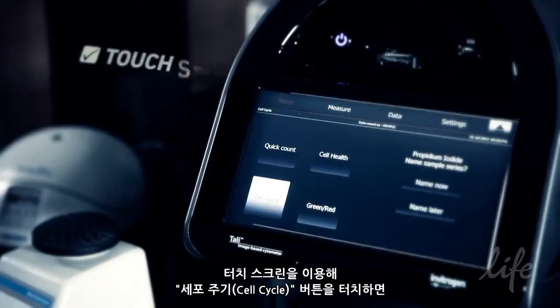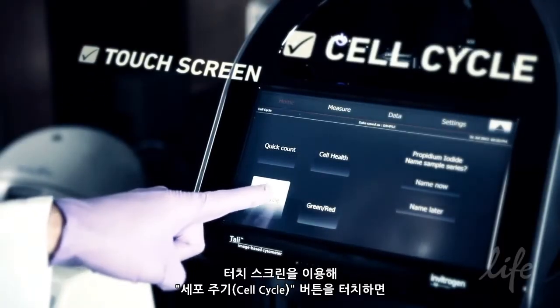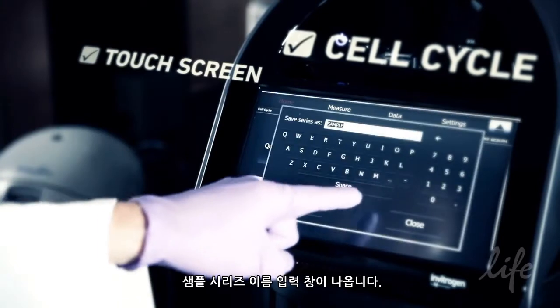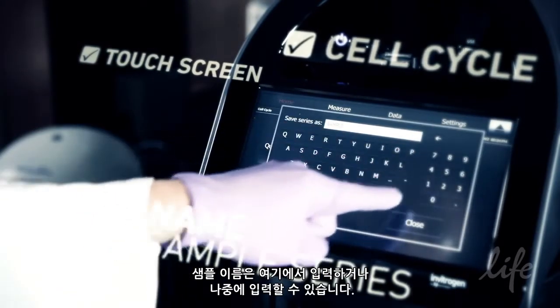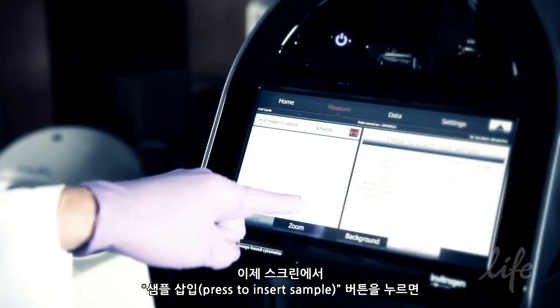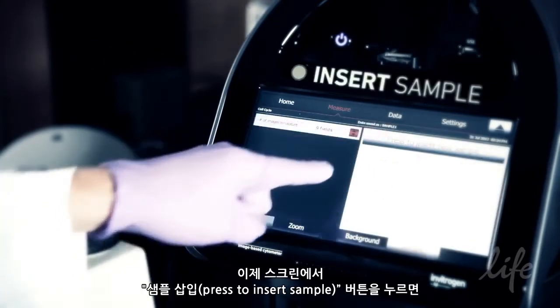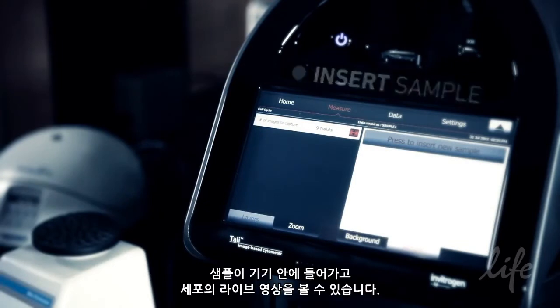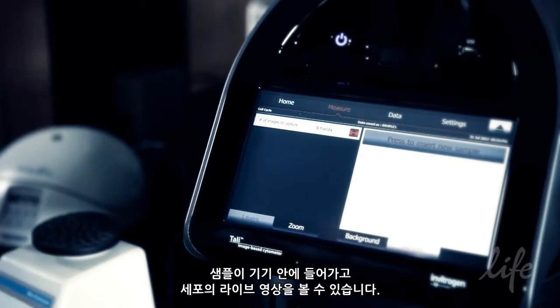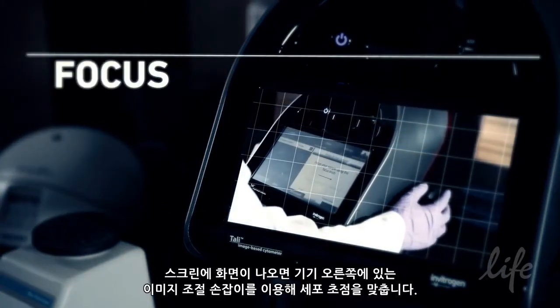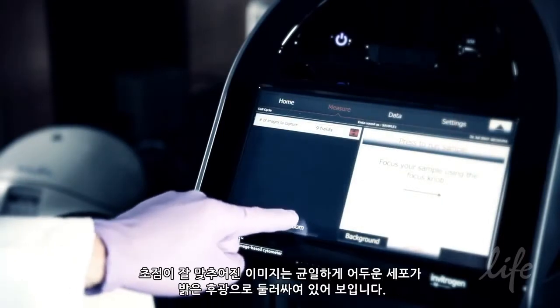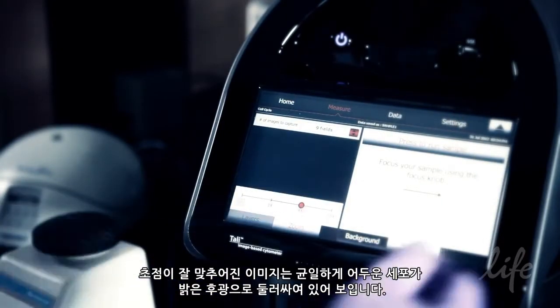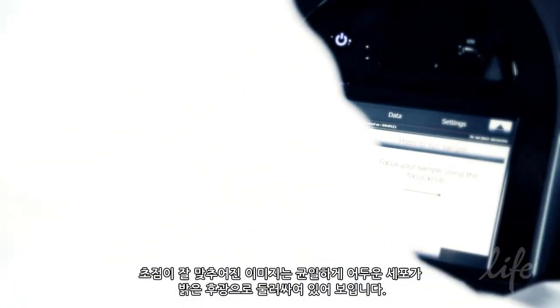Use the touch screen and touch the cell cycle button. Follow the prompts to name your sample series — you can name the samples now or you'll have opportunities later. Touch the press to insert sample button on the screen. Your sample will be drawn into the instrument and you'll be shown a live view of your cells. When prompted, focus the cells using the image adjustment knob on the right side of the instrument. Correctly focused images have uniformly dark coloured cells surrounded by bright halos.